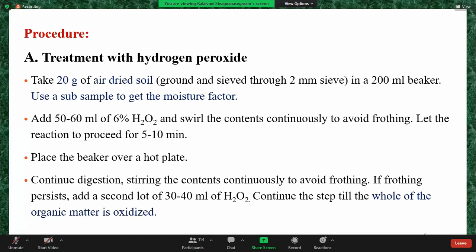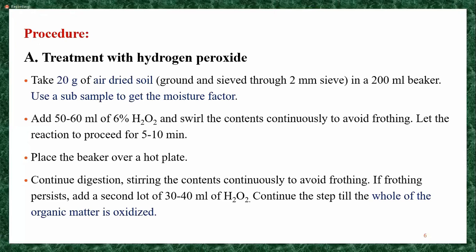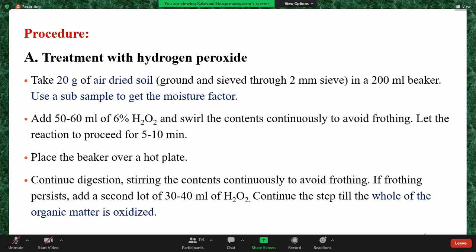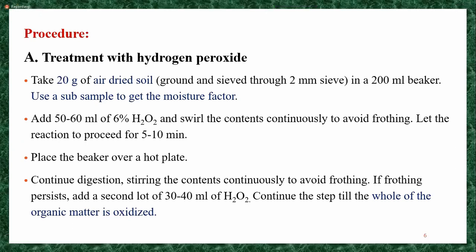Sorry, remove that. Unwanted particles means what? We are closer to the answer, but unwanted particles means. Okay, organic matter. So we are going to oxidize this organic matter by adding the hydrogen peroxide.